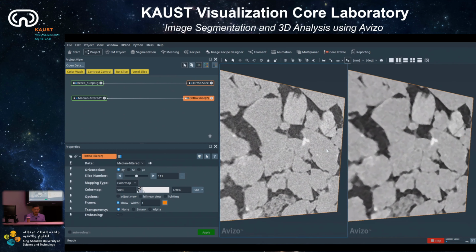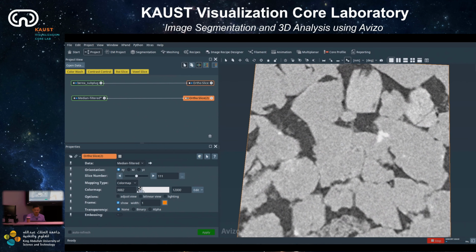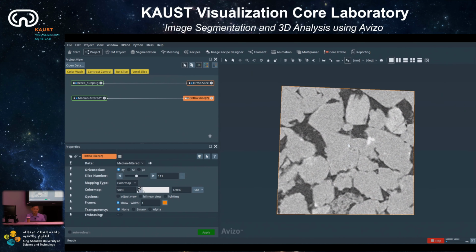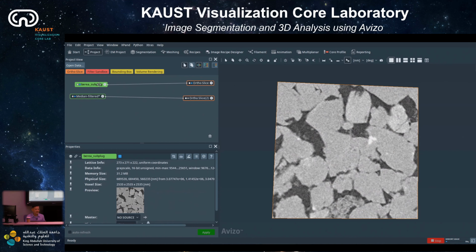And now, just go back to one viewer, and we're going to work on segmentation. If you remember from PerGeos, first you go to the tab step by step. The first workroom is image preprocessing. The next one is segmentation. So in Avizo, what we do is we just directly attach the segmentation module like auto thresholding, interactive thresholding, or any kind of thresholding. So let's go to the first data set.